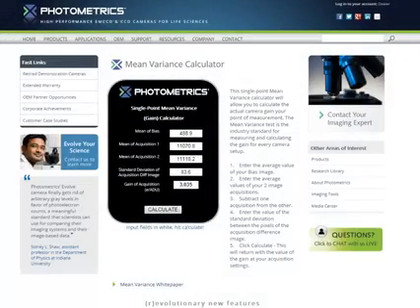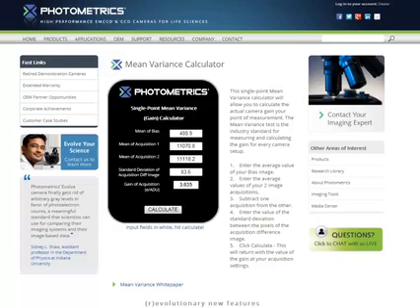This is a quick movie showing you how the mean variance calculator works on the Photometrics website. This is a really excellent tool for telling you how your camera has a relationship between the number of grayscales it's got and the number of electrons it's captured. So it's actually going to allow you to come back to photoelectrons — it's a really neat little tool you can use.